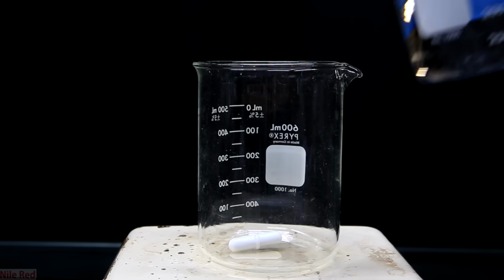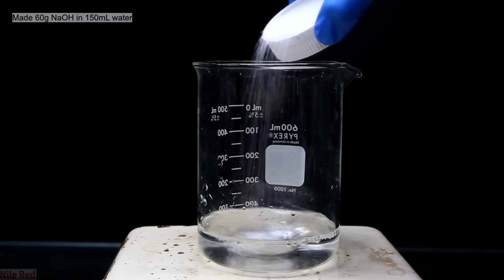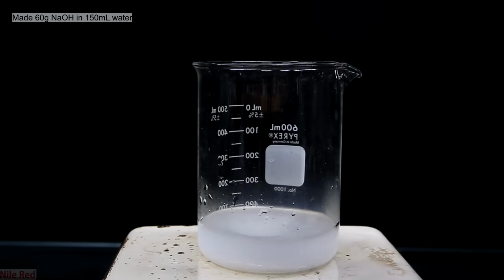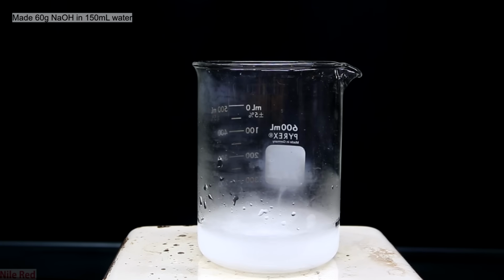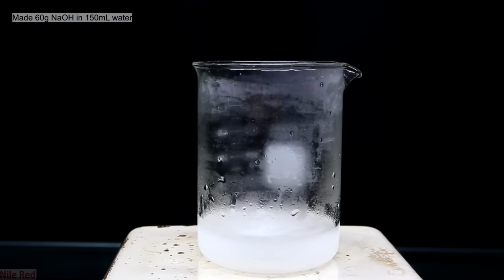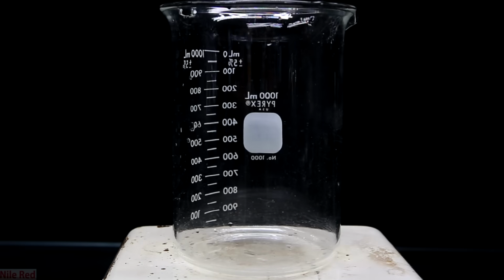The first thing that I do is I prepare a sodium hydroxide solution. With stirring, I added about 30 grams of sodium hydroxide to roughly 75 milliliters of water. It actually turned out that I used twice this amount of solution, so instead I would actually use 60 grams of sodium hydroxide in about 150 milliliters of water. As the sodium hydroxide dissolves, it will produce a lot of heat and the water will get pretty hot. It was stirred until everything was dissolved and it was somewhat clear, and then it was placed to the side.